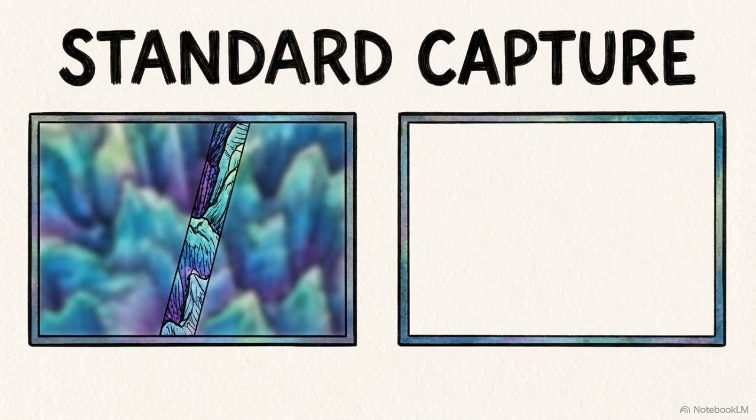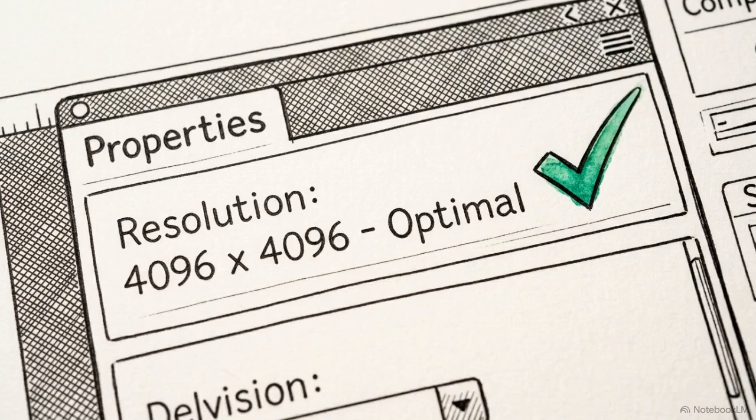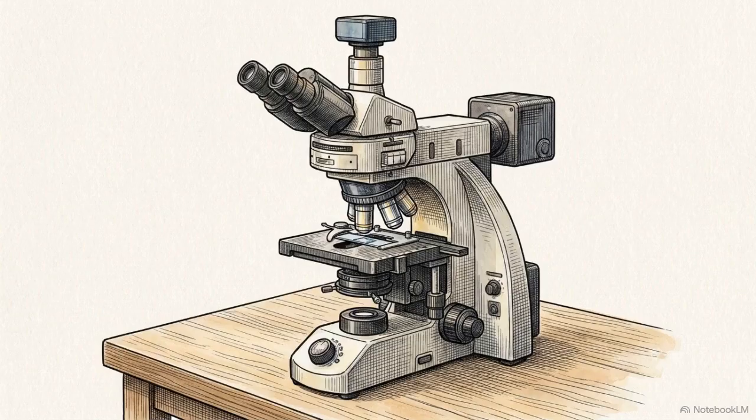This comparison illustrates the result. The left side is a standard single-focus snapshot. The right side is your new EFI file, displaying the exact same sample perfectly crisp from edge to edge. Take a moment to verify the file's resolution specifications so you know it meets the exact requirements of your analysis.